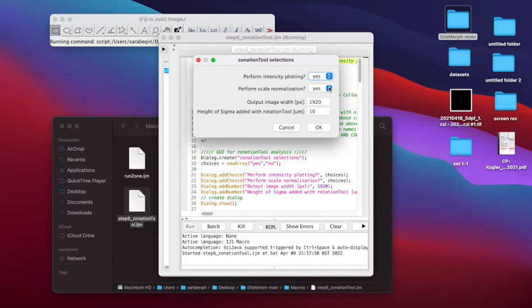We suggest that you run both with and without normalization to check with your data and see if either of them works better. What this does is that it stretches the images to similar sizes, but for images that contain significant differences, it may not make sense to stretch them, as it would lead to distortion.